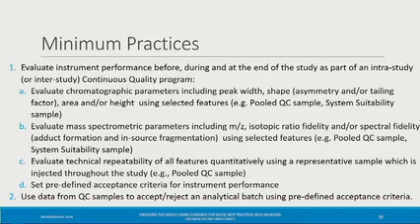So I want to hear your take on that, because with prior extraction, you have the variation from the extraction and from your instrument, right, that you cannot detangle. So that's how I see it, and I want to hear your take on that.